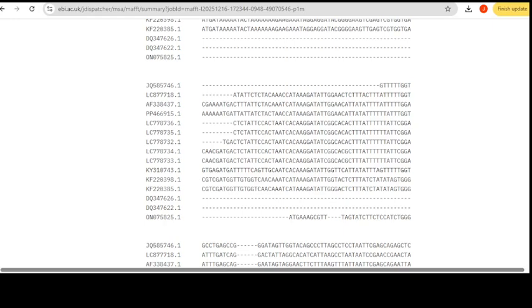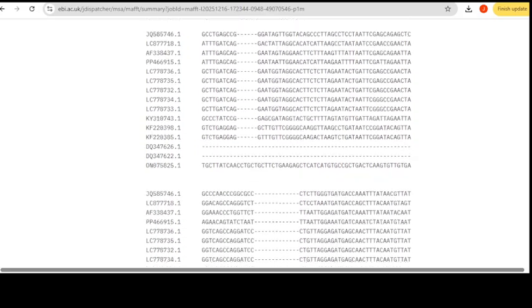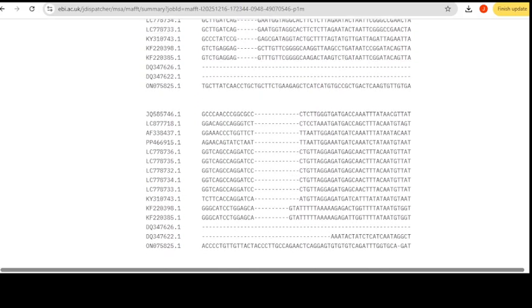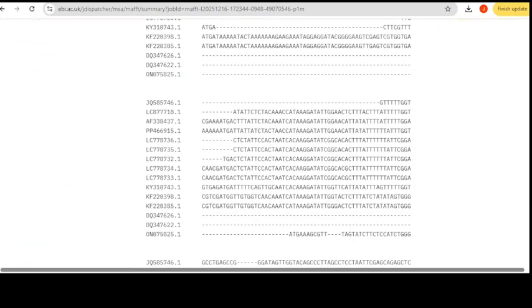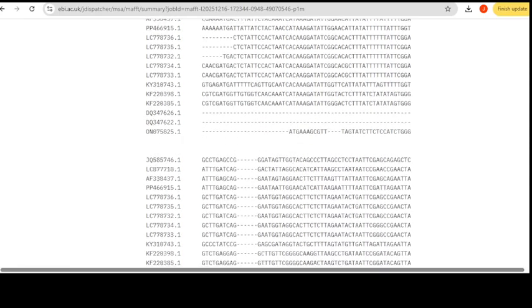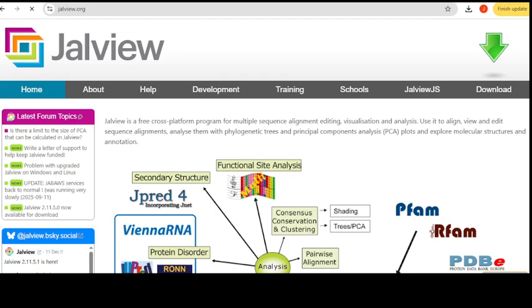So it will not be going downward like this, but from left to right. Right now it's going downward. When it finishes, it turns around, goes to the next line, and keeps going to the next lines. So this one block, all 15 reads here, we see are going into the next block. So let's see the next step.